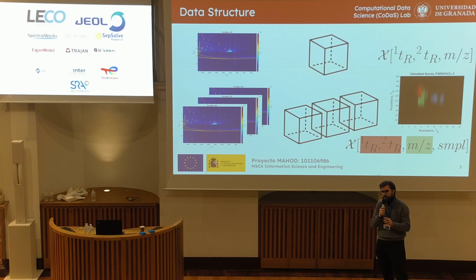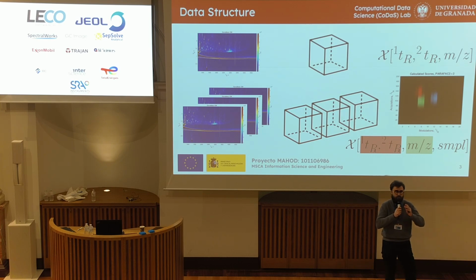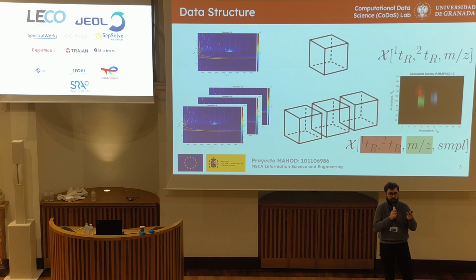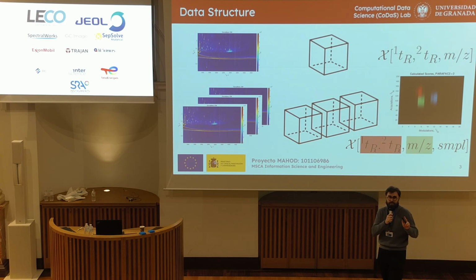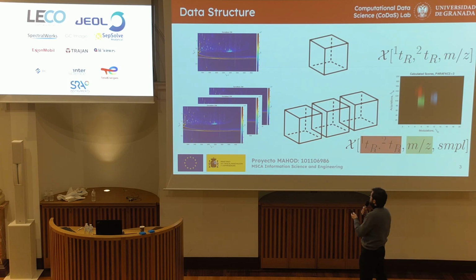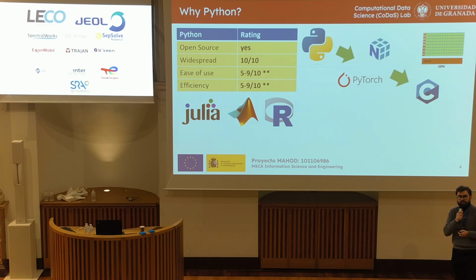Now, the trouble with this, when you're doing it in the time domain, is that you're squaring out these regions within which you expect peak drift to occur. So if one of your friends or supervisors sticks their fingers in the modulator and breaks the second dimension column, it's a great way to reconnect with your faith that the actual chemical components won't drift too much. So ultimately, we're looking at heterogeneous data analysis, because if it's homogeneous, if the column configuration is relatively consistent, then it should be good. And for this analysis, I'm going to be using Python, because I hate MATLAB.